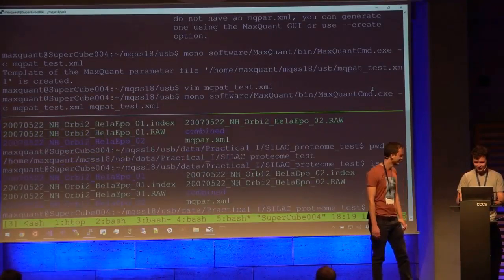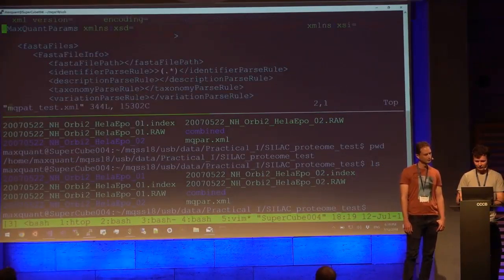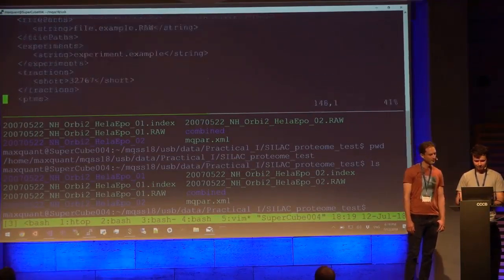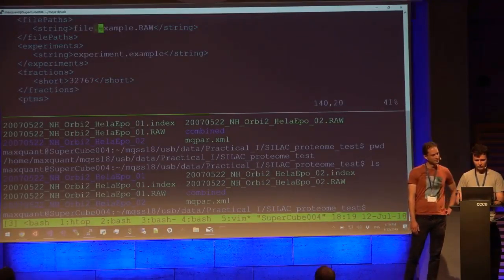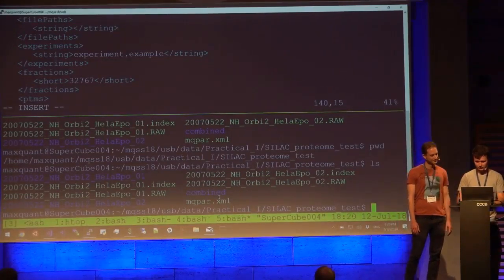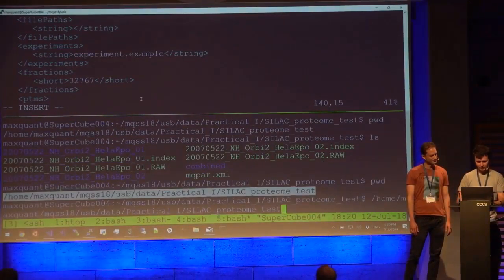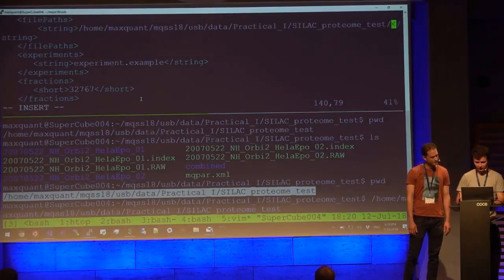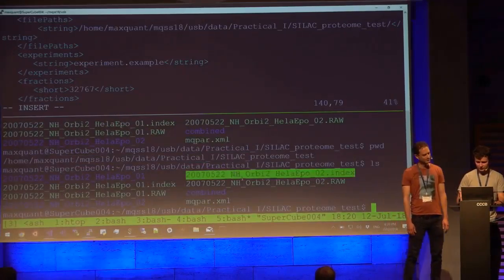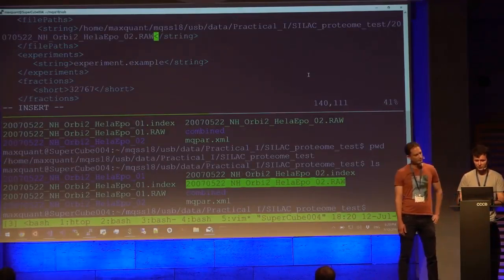Okay, what I'm suggesting is to just change this mqpar file and add one raw file. Actually, I don't remember where it is. If we go just lower. Yeah, here we go. So here I just have to specify where I can find this file. This directory is the folder which we just copied. And now if I insert it here and write the name of this folder, I'm sorry that this looks horrible. It's actually not index. Yes, basically we specified the raw file. That's it, it's enough.